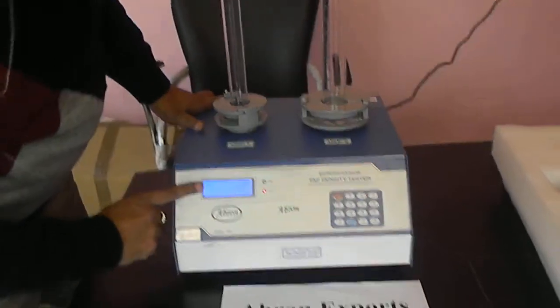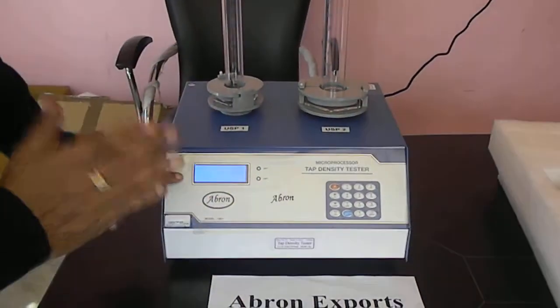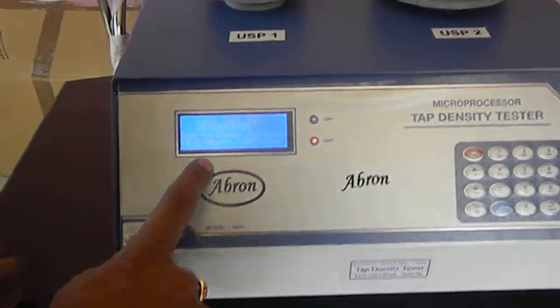It has a microprocessor based system and it has readings. You can see there are readings on the display.